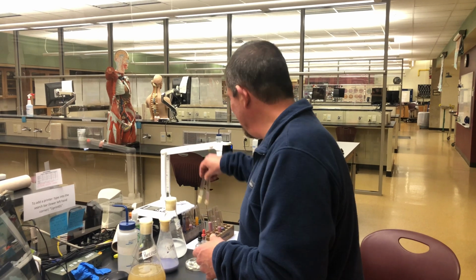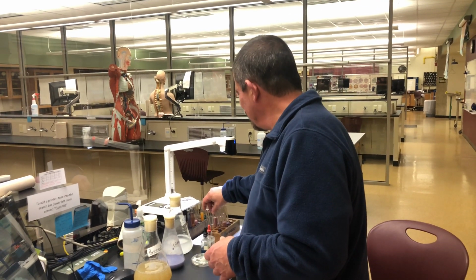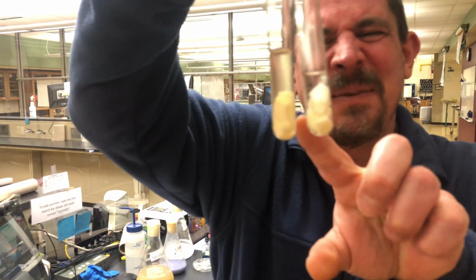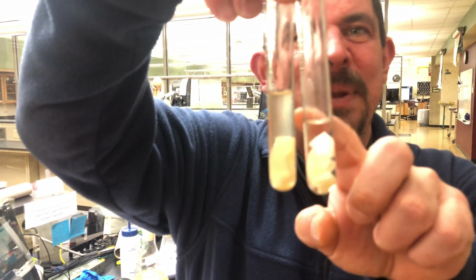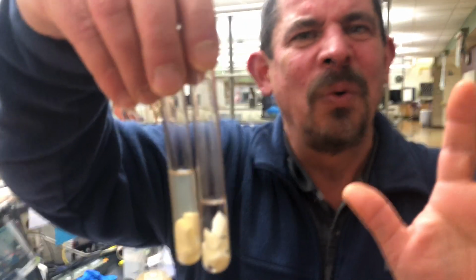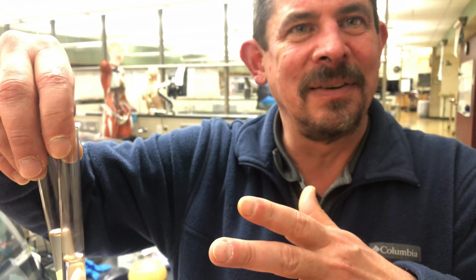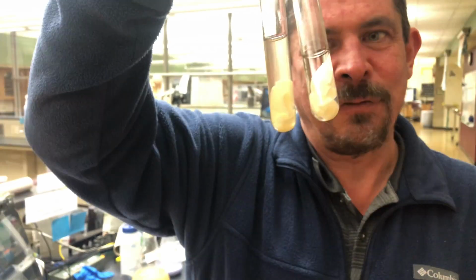And so our test tubes end up looking like so. We can see the egg whites down at the bottom. This is the one with the distilled water, and this is the one with the pancreatin. Don't worry about knowing the milliliters of how much we added. There's other important stuff that we want you to know. The big thing is we want you to know what shows a positive indication of protein digestion occurring versus which one doesn't. So this is what the test tubes would look like after we're done.